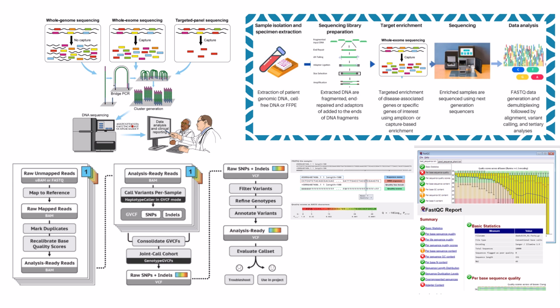Wow. And what kind of information is it pulling from all those sources for each variant? Really critical context. For starters, gene location. Which gene does this variant fall in? Is it in an exon, a protein-coding part, an intron, or somewhere else? Then protein impact. What does this change potentially do to the protein sequence? Is it a silent change, one that doesn't alter the amino acid? A missense change swaps one amino acid for another. A nonsense change creates a premature stop signal. Or maybe it affects splicing. Okay, so location and predicted effect on the protein.